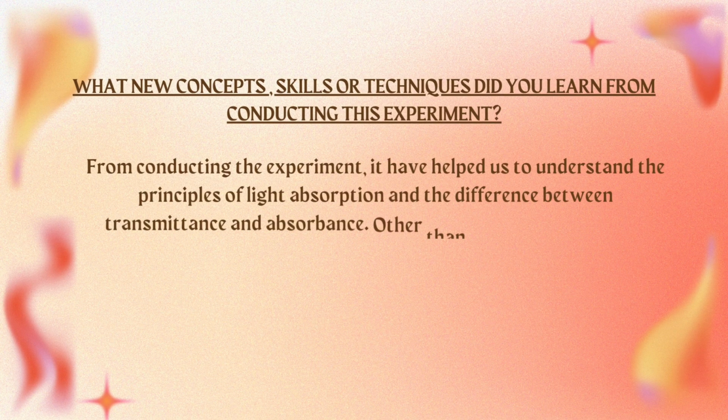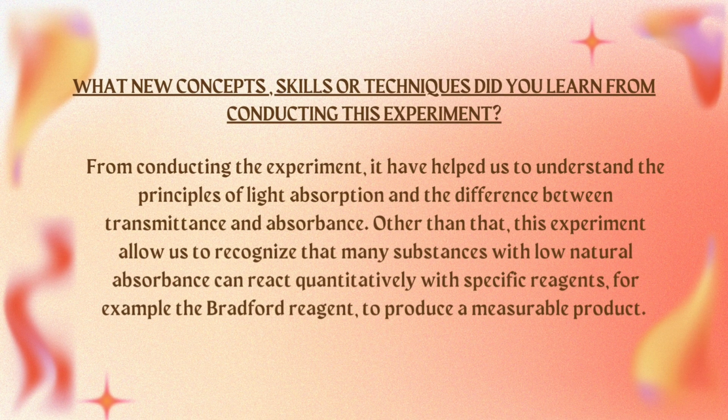From conducting the experiment, it has helped us to understand the principle of light absorption and the difference between transmittance and absorbance. Other than that, this experiment allows us to recognize that many substances with low natural absorbance can react quantitatively with specific reagents, for example, the Bradford reagent, to produce a measurable product.